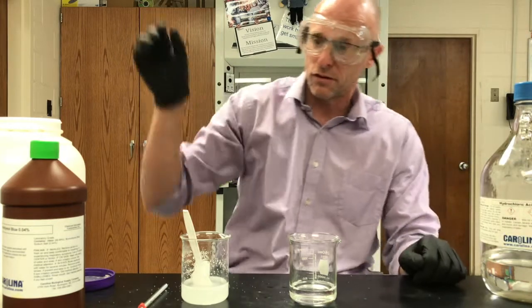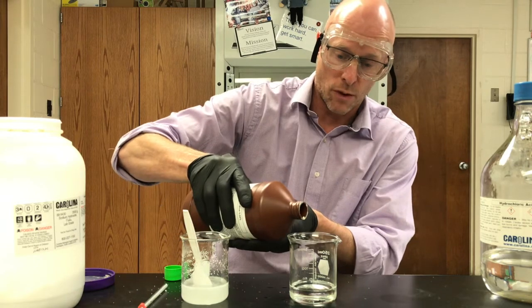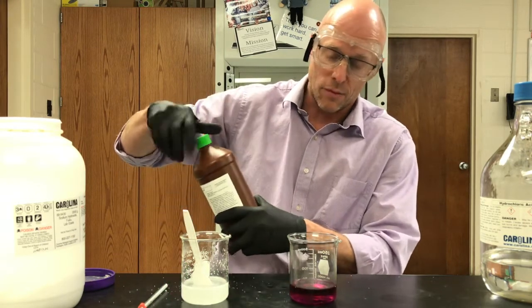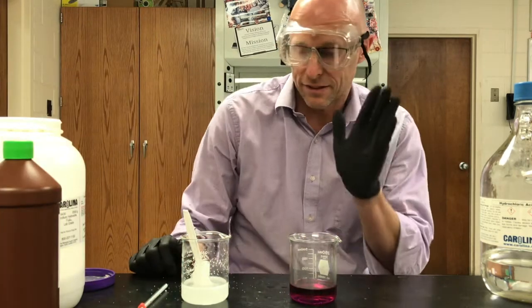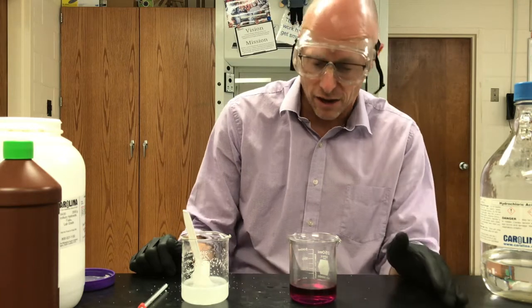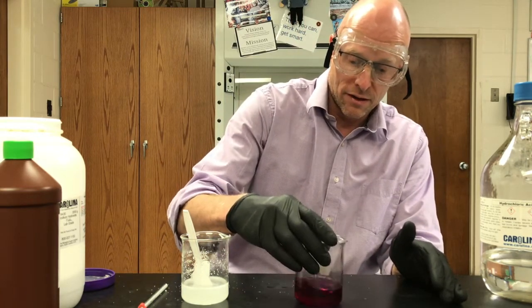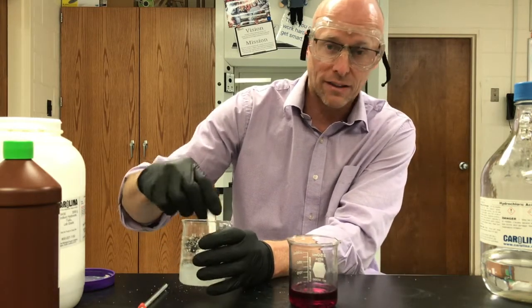That should be enough — a little bit of bromothymol blue indicator. Now, bromothymol blue in an acid is usually yellow, but what happens when we've got a really strong acid? We get a red color, and that's my experience.